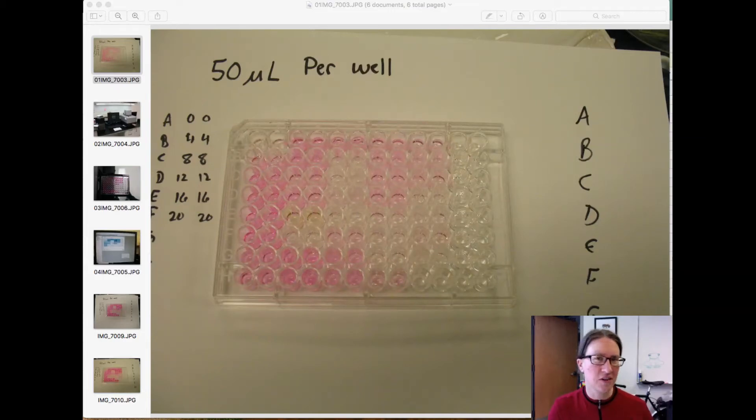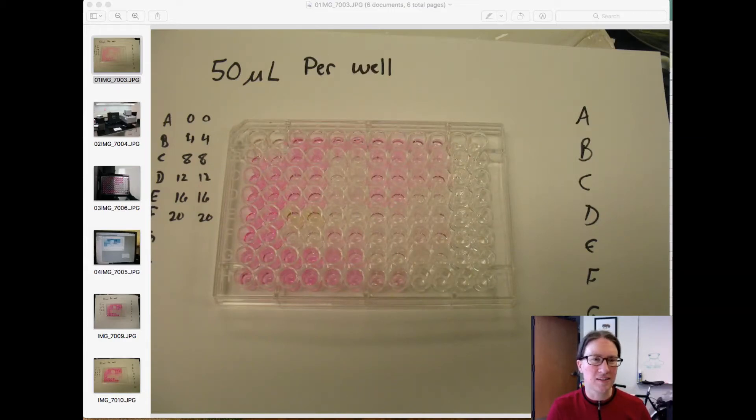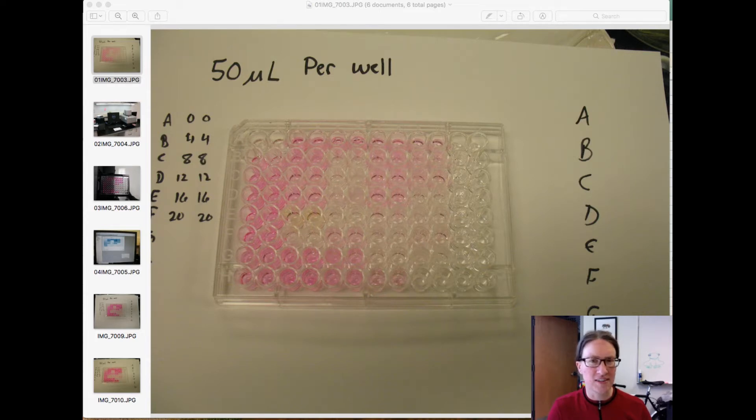Hey everybody, so here's the video I promised to walk you through how to analyze the data from our uric acid assay.